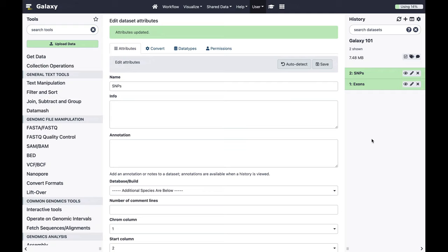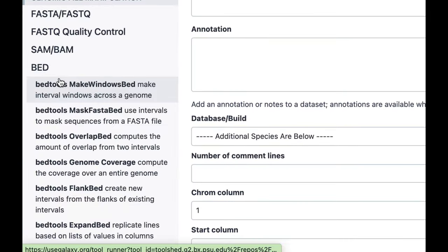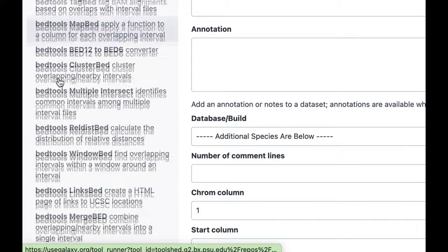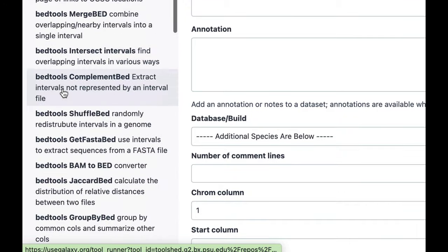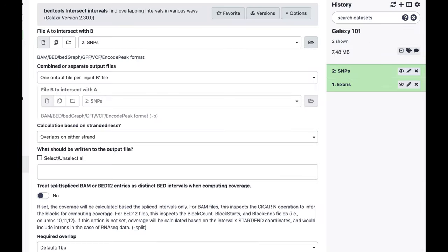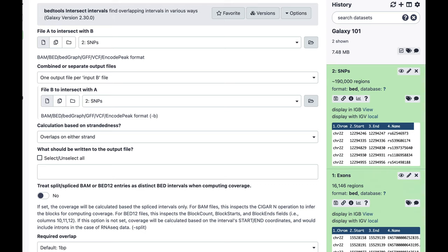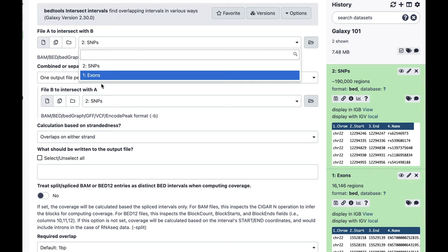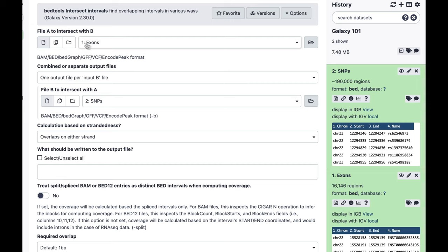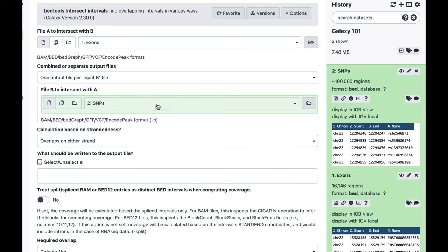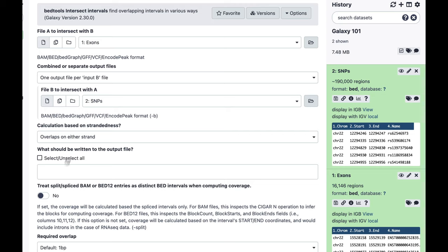The first thing to do is intersect exons with snips to figure out which exons actually contain snips. To do this I'll go to BEDtools and find the tool called 'BEDtools Intersect Intervals'. This tool intersects one dataset with another — dataset A and dataset B. In our case dataset A is exons and dataset B is snips, so let's select exons here. You can select datasets from history using the dropdown or drag them directly.